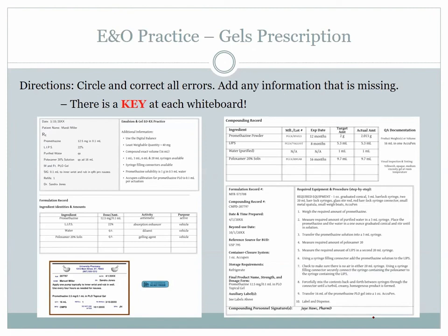So at this point, let's just make the product. To get out of lab, you got to make the product, and you'll bring it over in your AccuPen after you've completed the worksheet. So we'll look at your worksheet, we'll look at your AccuPen and your product, and we will tell you to have an awesome semester and good luck on finals. We're almost done. So get out there and let's do it. Thanks for your patience.